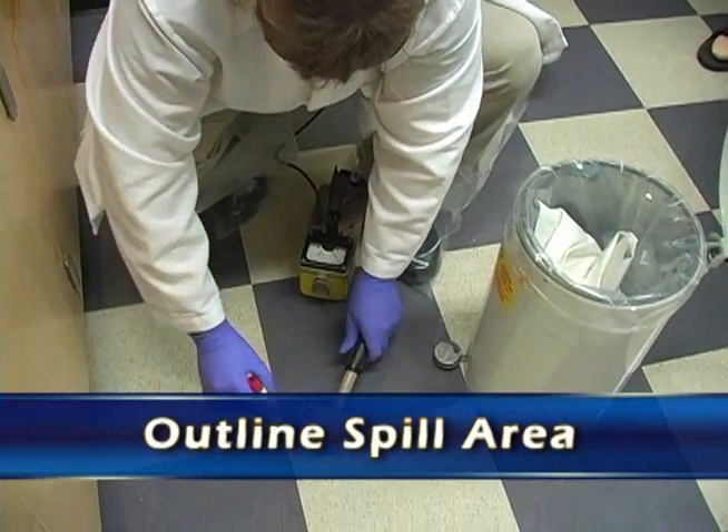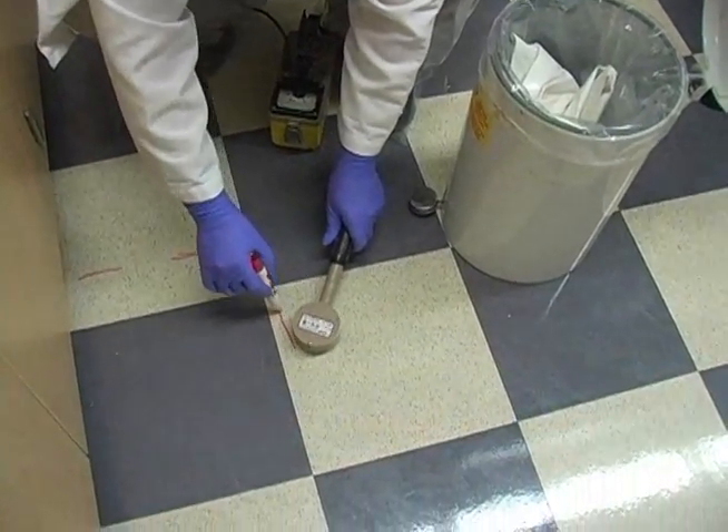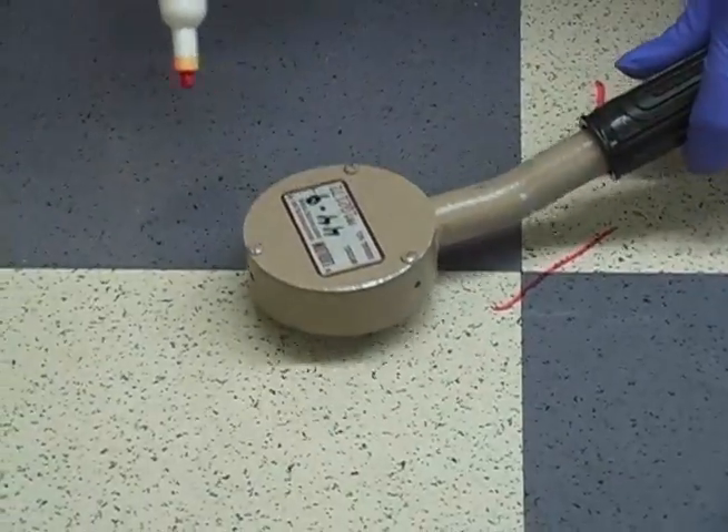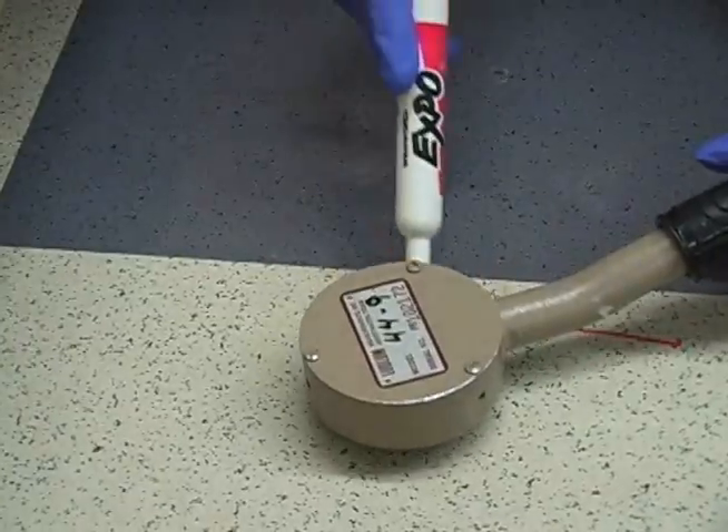Outline the spill area. Here we're looking on the floor, finding out where the area of contamination is and marking it off so we know how to work.